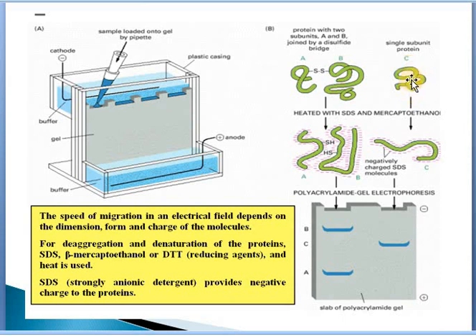protein. When we carry out SDS-based denaturation, the two chains A and B of protein 1 get broken into two different protein chains, that is A chain plus B chain. AB turns into A chain and B chain. When you apply an electric field, that protein turns into two different bands, that is A band and B band, according to the molecular weight.